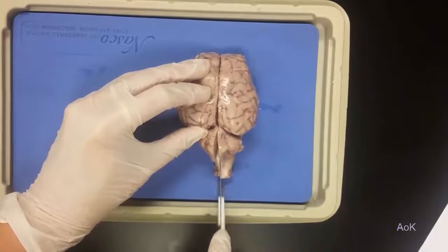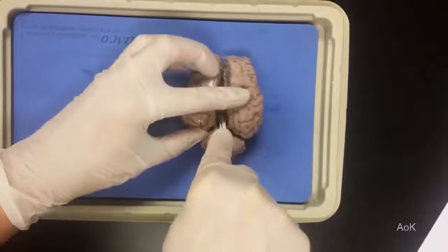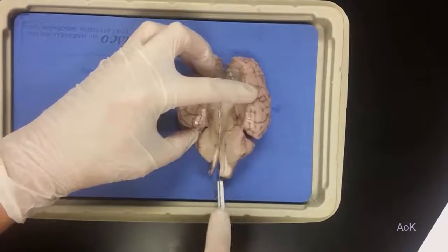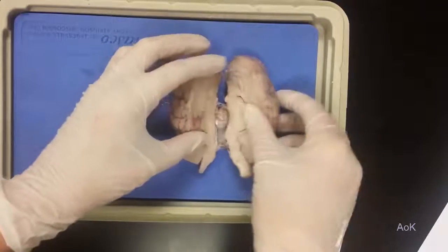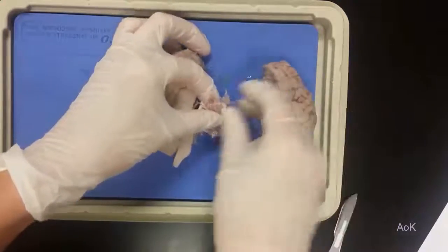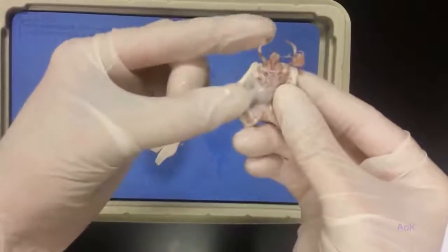Try to make a clean cut all the way through so that you can see the internal structures better. Notice on this brain, the meninges and the pituitary gland have fallen off, along with some cranial nerves.